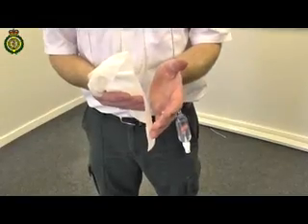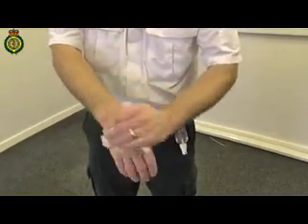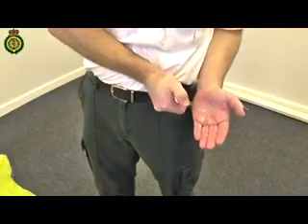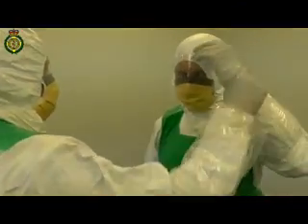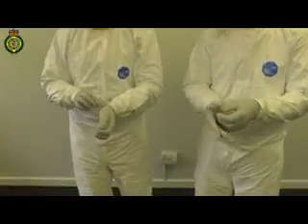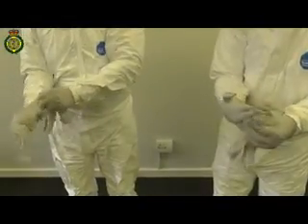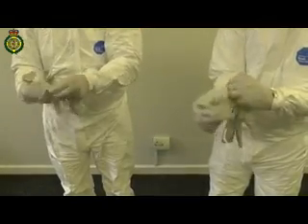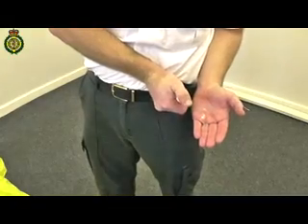Remove your gloves. If soap and water is available, wash your hands thoroughly, otherwise use vehicle wipes and alcohol gel. Remember, at all times, never touch your face or anything inside your protective clothing. Remember, double glove. Changing the top pair of gloves on a regular basis so as not to contaminate areas. Use hand hygiene as often as you possibly can.